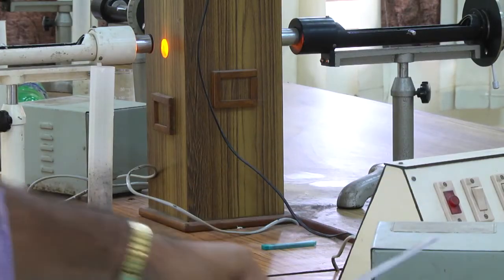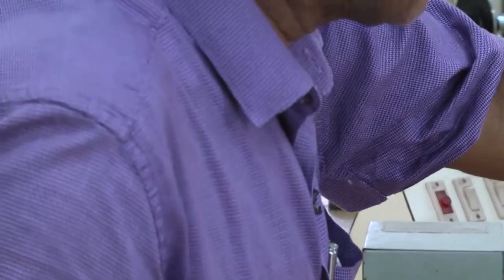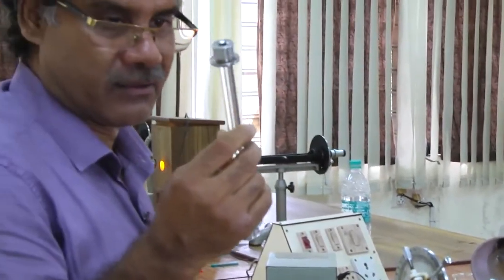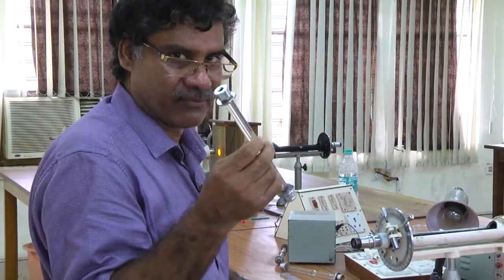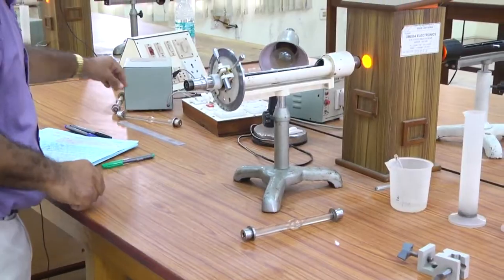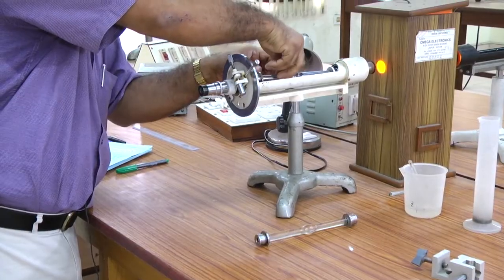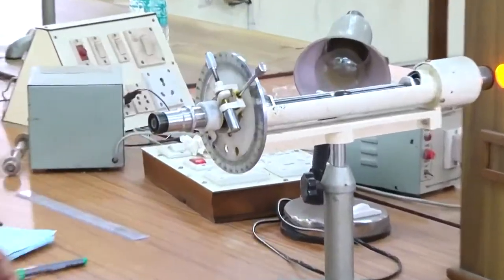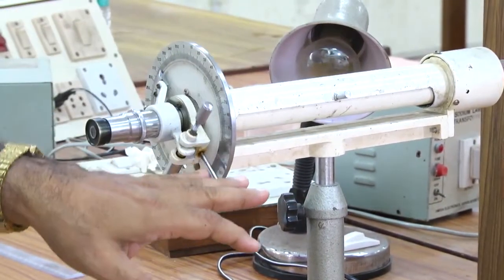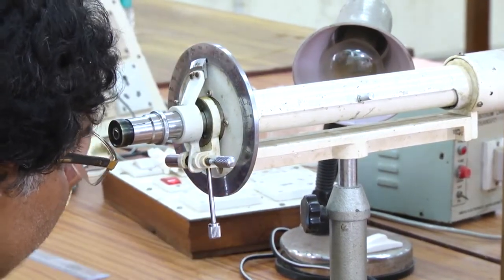So this you have to measure or it is supplied. Here basically the similar tube, where we have put 20% concentration of solution, and using that one I was showing you these four regions. First, with the same tube, you have to take this water. For water you have to find out this uniform shaded region.